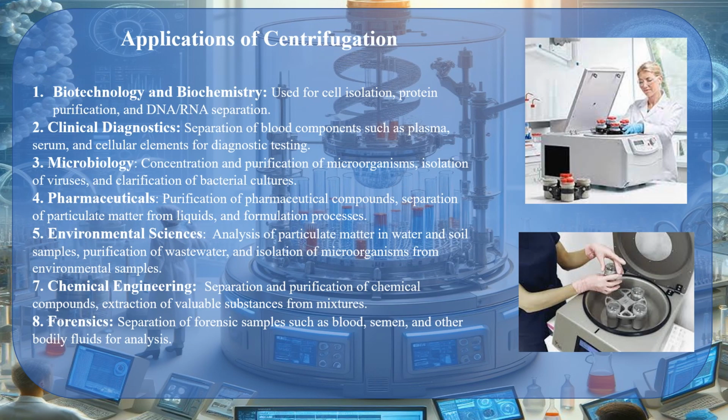Next is applications of centrifuge. They are used in biotechnology and biochemistry, clinical diagnostics, microbiology, pharmaceuticals, environmental science, chemical engineering, and forensics.